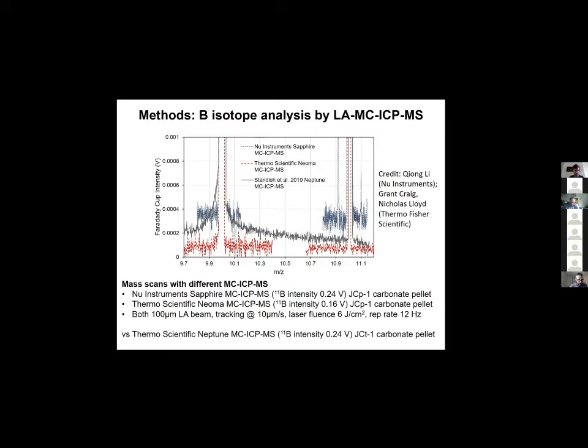And the key thing here is that they're essentially flat. You don't see this irregularity, and they also don't change with the sample materials. So carbonates versus silicates, they kind of overlap. So it looks like it's a model-specific issue. With these, I suspect the key tuning parameters are plasma conditions. But if someone is using an instrument that has the kind of matrix interference issue like the Neptune, then this can be corrected for using the approach developed in that methods paper.